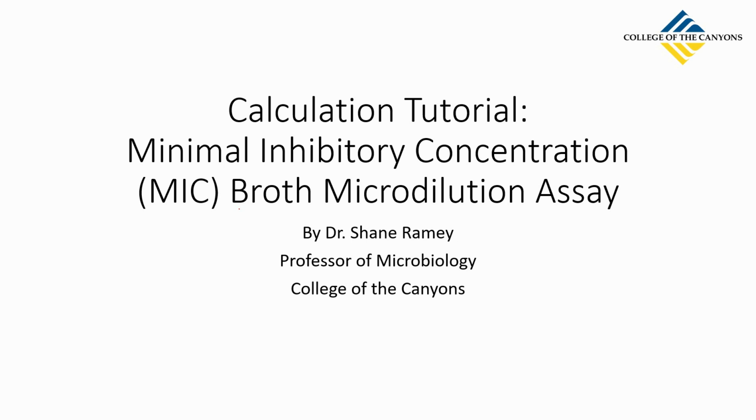Hey, Dr. Ramey here again with another video tutorial. This one on how to calculate the minimal inhibitory concentration using a broth microdilution assay. So let's dive right in.